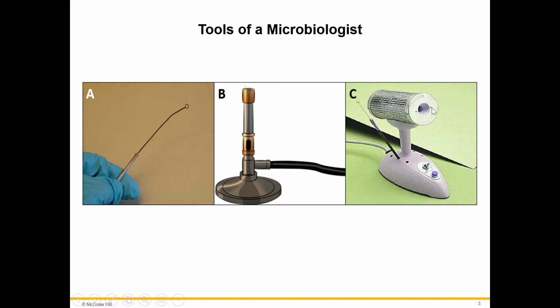The main difference between these two is this one has an open flame and this one has the sterilization compartment enclosed. This one is much safer to use in a laboratory or a hospital laboratory, but they both have dangers. So they both get very hot and you have to be careful with them either way. But you don't really want to light up an open fire in a hospital. So we use these more commonly in a clinical lab or a microbiology lab in a hospital.